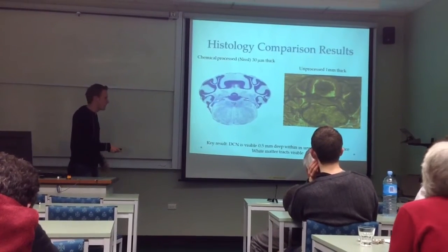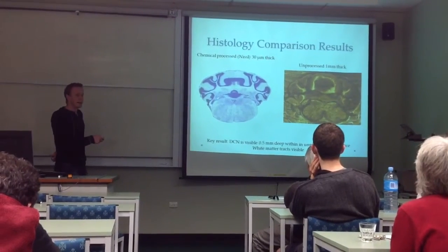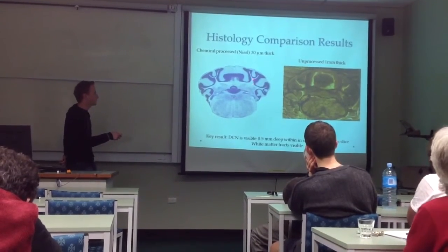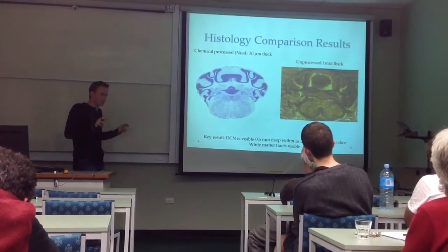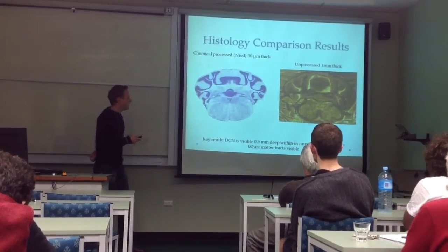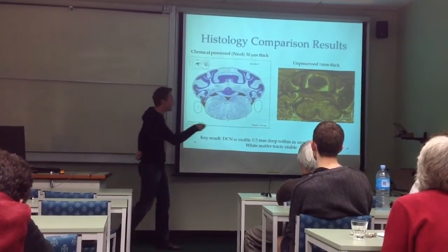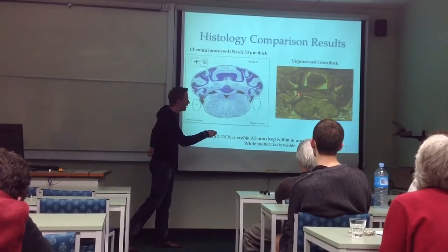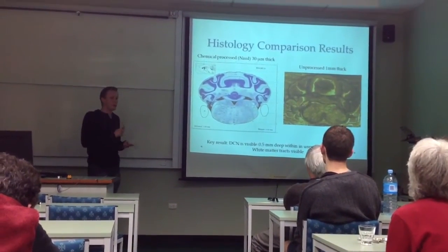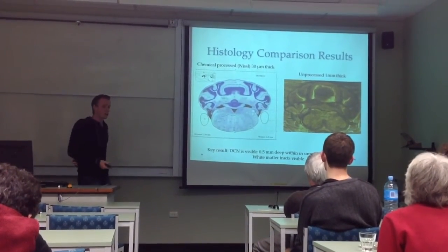When we do that, here's an OCT slice, an image, just one image out of a whole stack of 3D images, looking sort of down on the tissue, and here's a histological preparation. This is a Nissl stained, which just makes the cell bodies of the neurons pop out, which is why where you see white is the white matter, and the dark is the grey matter. So you can see similar structure on this. What's great, super exciting, is that these nuclei here are the ones we're after. And you can see there's slight contrast in the same region on that one. So without the staining, without the chemical processing, without the very super thin slices, we're getting structural information about where the neurons are, at least in the brain.